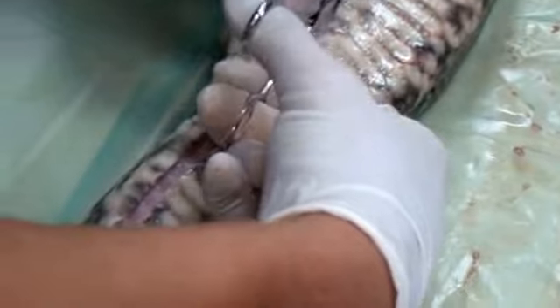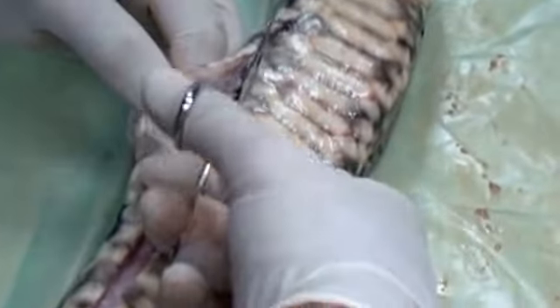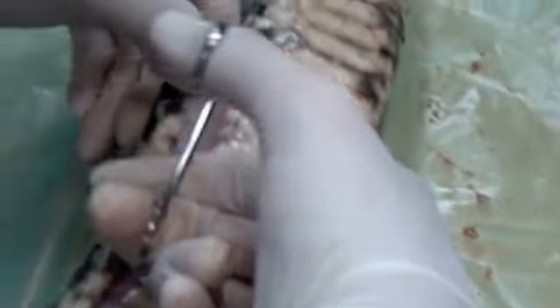Now, would it feel pain if you cut off its skin like this? Well, it's no longer alive. Yeah, but if it were alive. I don't know how their pain nerves work, honestly. I'm just trying to be careful. I cut past the fat.